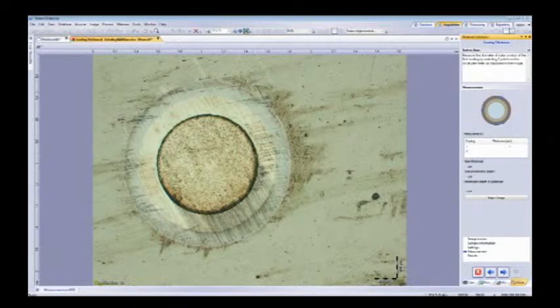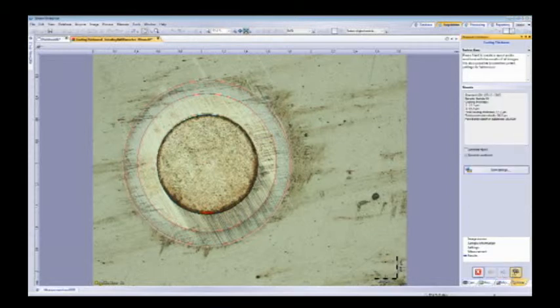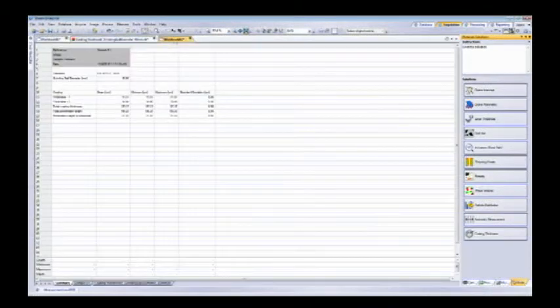And then it's going to physically ask us to mark the first outer layer. So we'll mark 3 points around that outer layer. And then we can move ourselves into the inner layer and then the last bottom base layer. And once we mark those 3 points, which is 2 layers, it'll give us our coating thickness over here. Again, if you had 100 samples, you could quickly go through these and get an idea. If it was a reject, you could just reject it out of the process. We just hit next to get our results. And again, just like all the other solutions, we hit finish and we get a nice workbook up here with all of our result and data. That you can export. That's great.